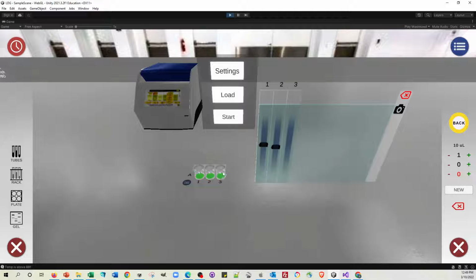The reason why this third one is not producing any bands is that the amplicon distance is absolutely massive, and the time that we set on the settings wasn't enough to make that work. But the crucial thing is now that we've got a lot more sophistication, because we're now looking at every stage of the cycle.